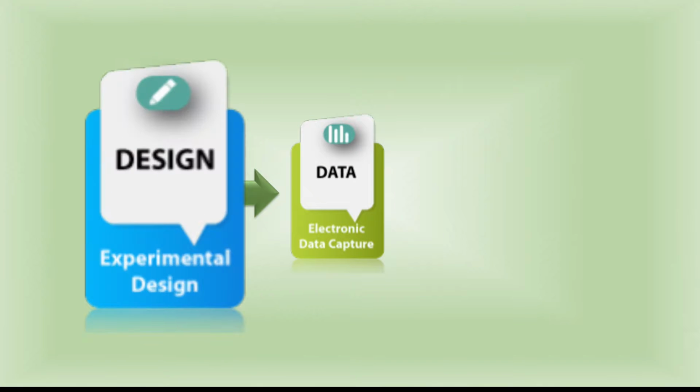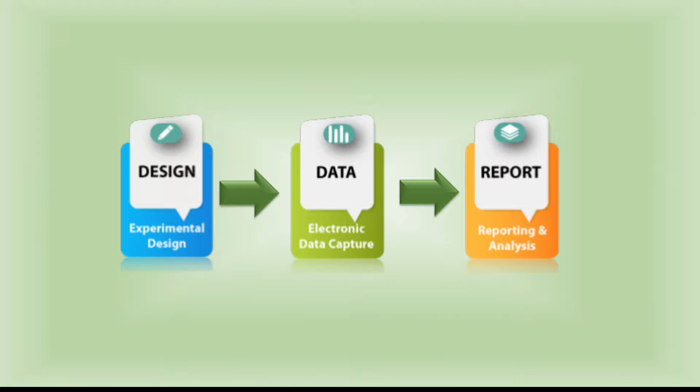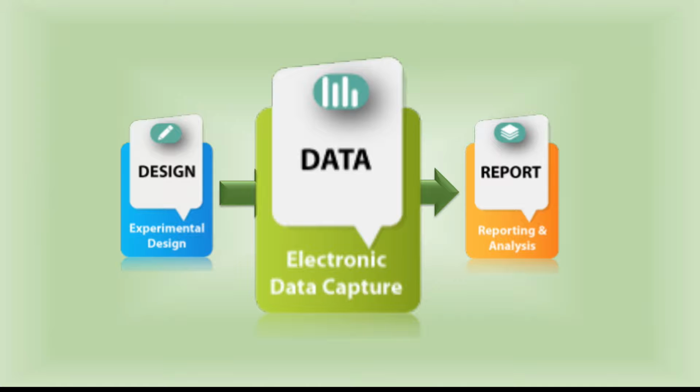When the study design has been finalized, Serologic seamlessly steps forward to help the researcher and optionally a team collect treatment and sample data at the right times and with accuracy while adhering precisely to the study design guidelines, ensuring that the data will effectively support the study's analysis goals. To understand how it works, let's start by looking at how Serologic supports study data collection. It is assumed the viewer has seen the experimental design module demo.